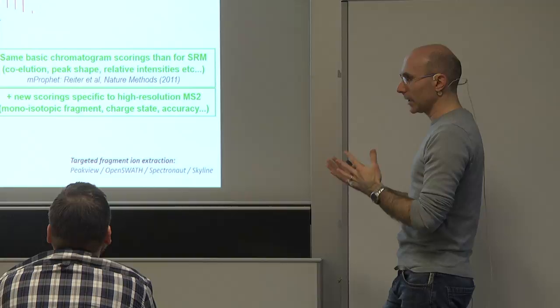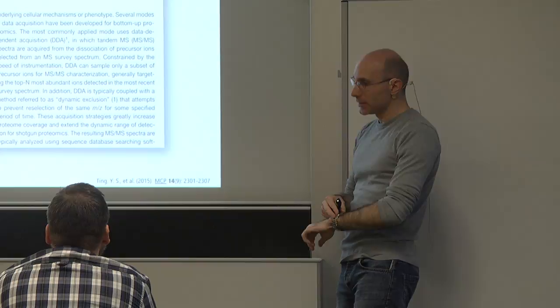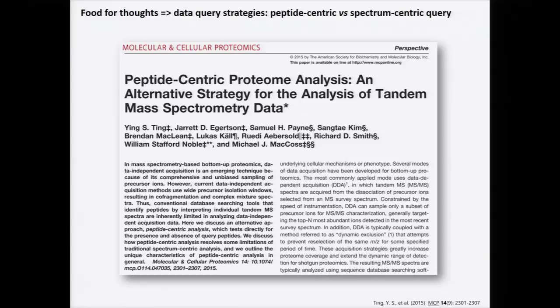And the comments I had about this different terminology were actually nicely emphasized in a paper that I really encourage you to read if you're interested in this story. It's this paper by the MacCoss group, and they asked many other professors in the field to give their okay on the terminology, as we all start to converge on the same terminology. And the idea is that we now call this approach a peptide-centric query strategy.